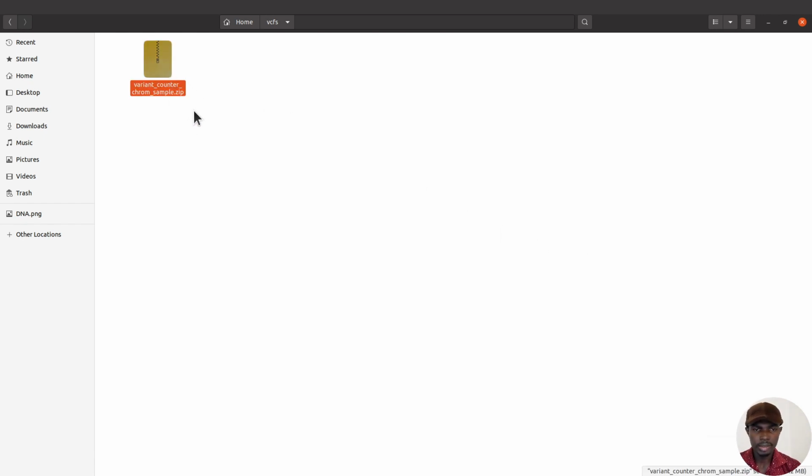So you are going to get something like this, and then you have to extract the content and then proceed. Right. So that's what we are going to do next. So once we download it, open your terminal and then start the exercise. So let's start. So I'll open my terminal now and then start.